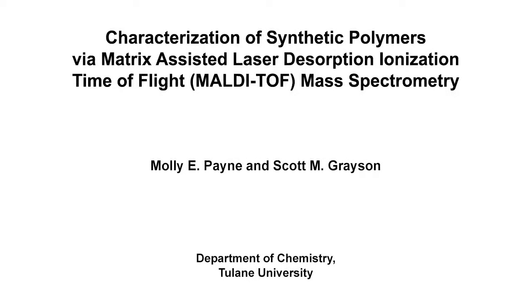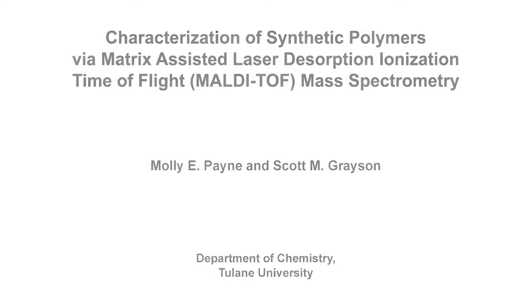The overall goal of this MALDI-TOF MS tutorial is to teach users about sample preparation, acquisition, and analysis of polymers during characterization by MALDI-TOF MS. This method can help answer key questions in the polymer characterization field, such as polymer molecular weight, dispersity, and end-group identity. The main advantage of this technique is that it allows for determination of homopolymer end groups.